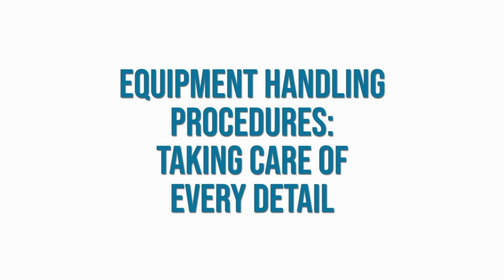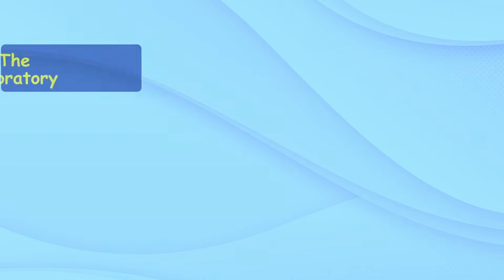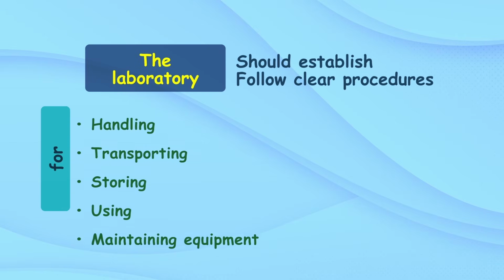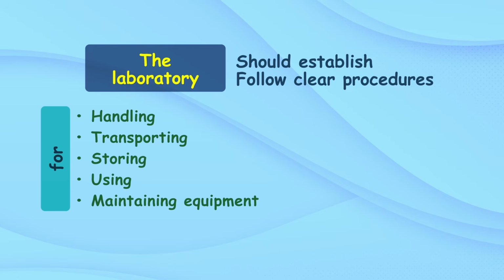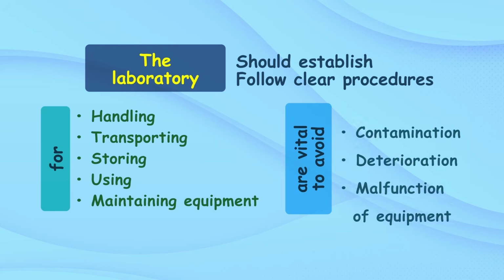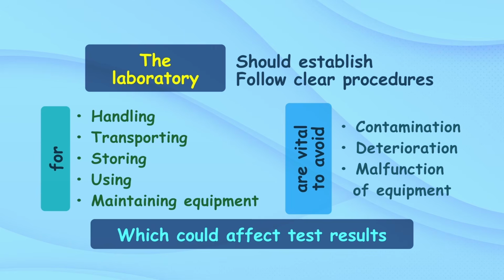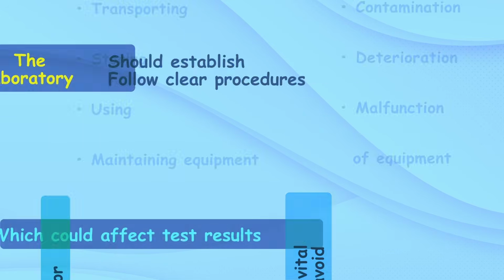Equipment handling procedures. Taking care of every detail. The laboratory should establish and follow clear procedures for handling, transporting, storing, using, and maintaining equipment. These procedures are vital to avoid contamination, deterioration, or malfunction of equipment, which could affect test results.